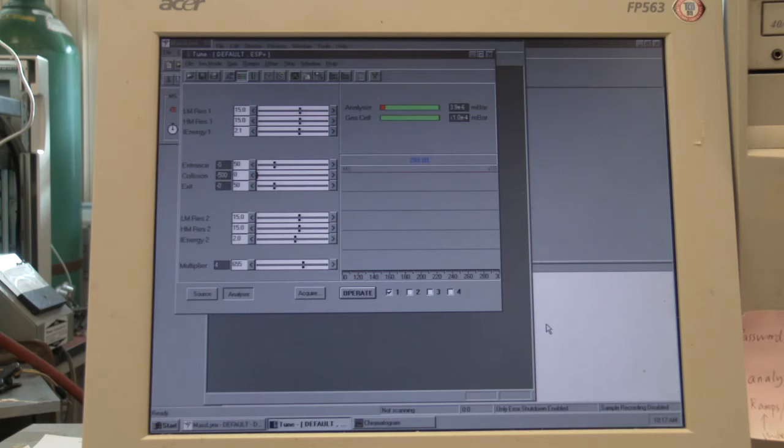The other very important region to know the pressure of is, of course, the detector region. This should be as low pressure as possible to help with sensitivity of the instrument. This instrument measures a pressure of 3.6 times 10 to the minus 6 millibars.